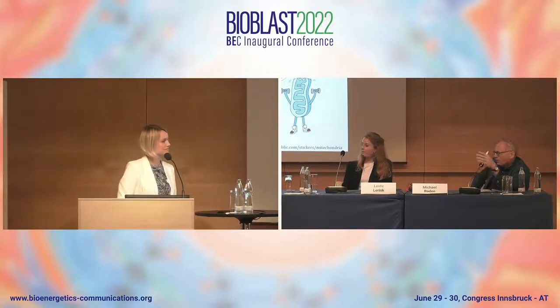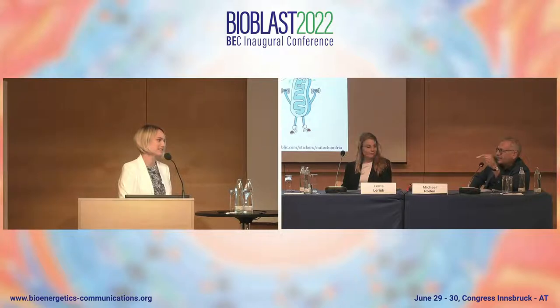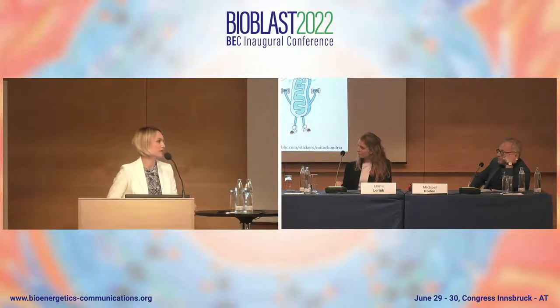Okay. I would also have a question, more from a physiological side. You said you studied brain cells. Brain has a lot of different cell types. So did you sort out if different cell types would react differently? Or when I look to your paper, do the myocardial cells behave differently from the brain cells that you studied? So we did not separate the brain regions or different brain cells. Unfortunately, we could not do this. But we did with isolated heart mitochondria, and we found exactly the same results and data.